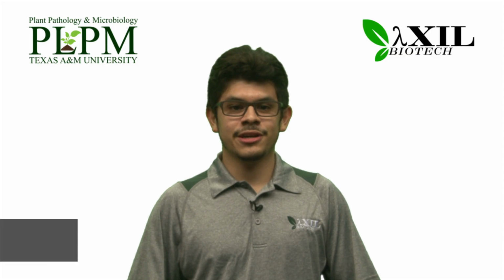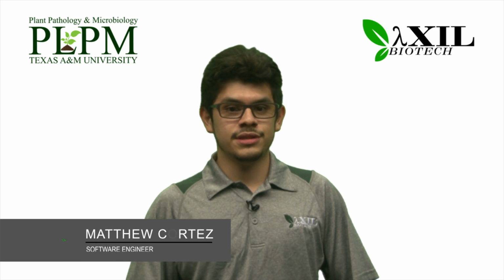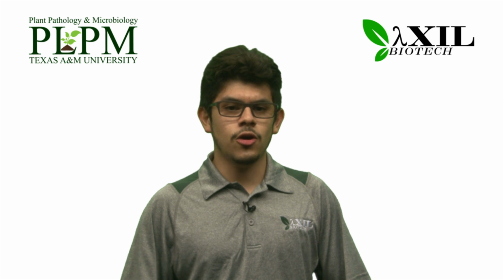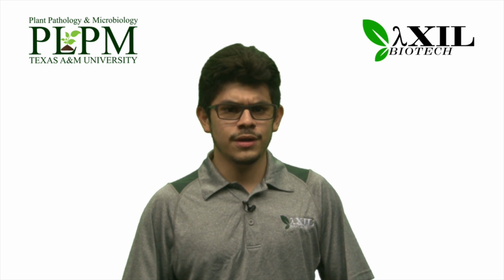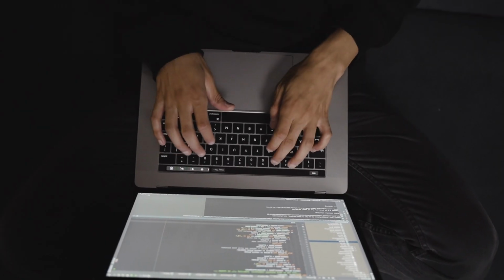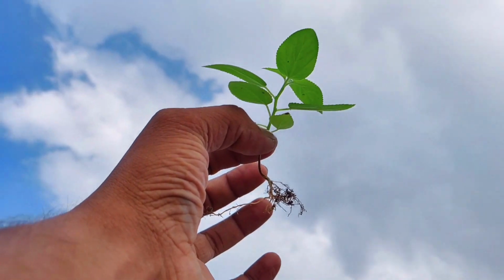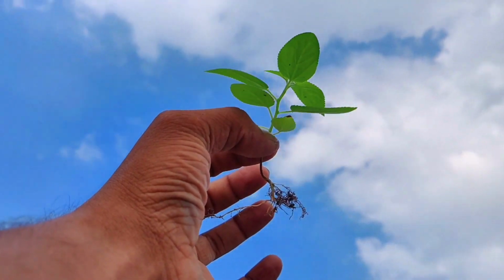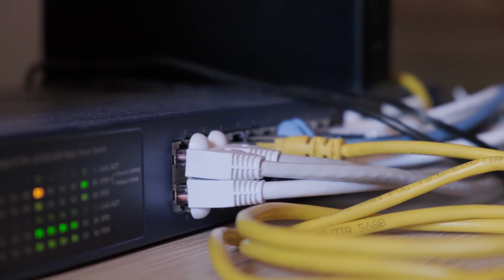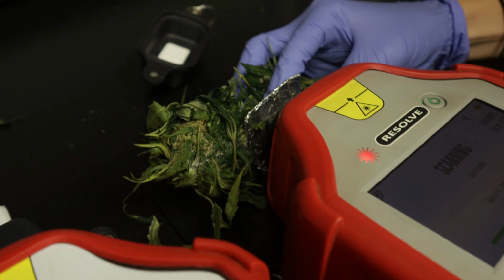Hi. Now we're going to talk about the computer vision targeting assistance portion of the project. This will use an industrial camera with a 3.1 megapixel Sony CMOS sensor and the OpenCV machine vision framework. Using this, we will program an object tracking algorithm in C++ to identify and distinguish both the spectrometer and plant leaves from foreign objects. The computer vision targeting assistance system will communicate with the motion control system to reposition the plant such that Raman spectroscopy measurements may be taken.